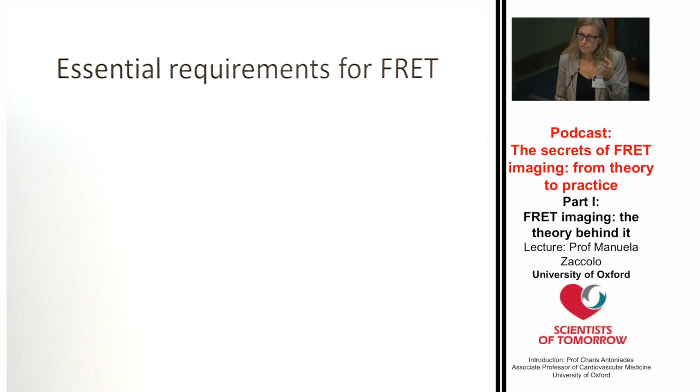But you may want to apply this approach to a particular compound or a specific protein-protein interaction that you're interested in, and there is no reporter for that. So should you embark on designing a new FRET reporter? And if you do embark on this enterprise, what are the basic considerations that you should make?